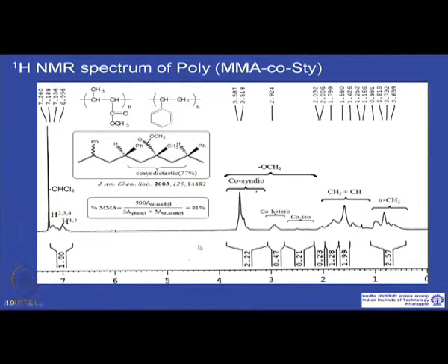And also we need to be very careful that we run as many scans in the NMR as possible to make this spectrum more quantitative. The fewer the scans, the more will be the error in the composition. So, from this example we can find out the composition of the copolymer and what type of copolymer it is. In this case, it can be seen it is more of a co-syndiotactic copolymer.